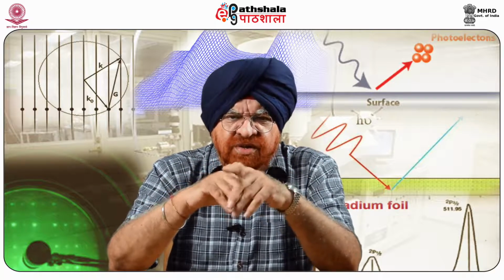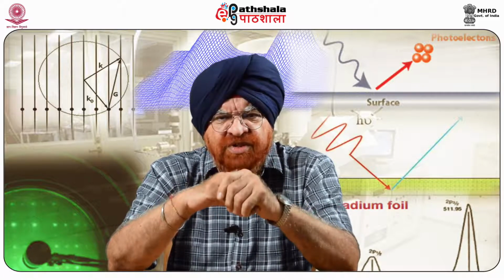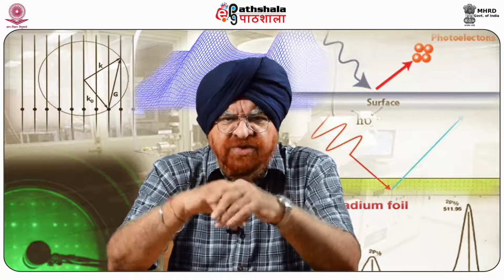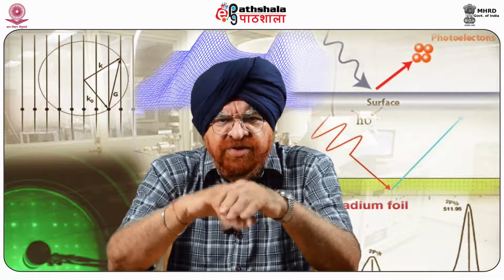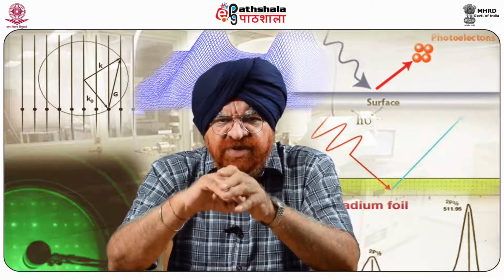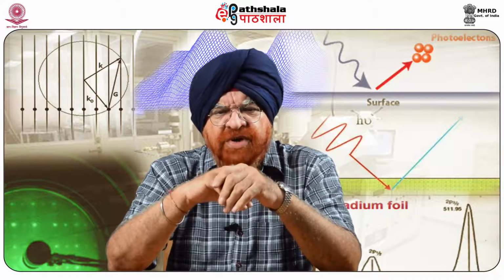But as I said, we do not have any details of atomic level studies in biological samples prepared by any of the methods. Clearly, procedures for specimen preparation must receive considerable emphasis if the potential of the STM is to be realized for molecules of biologically important materials.